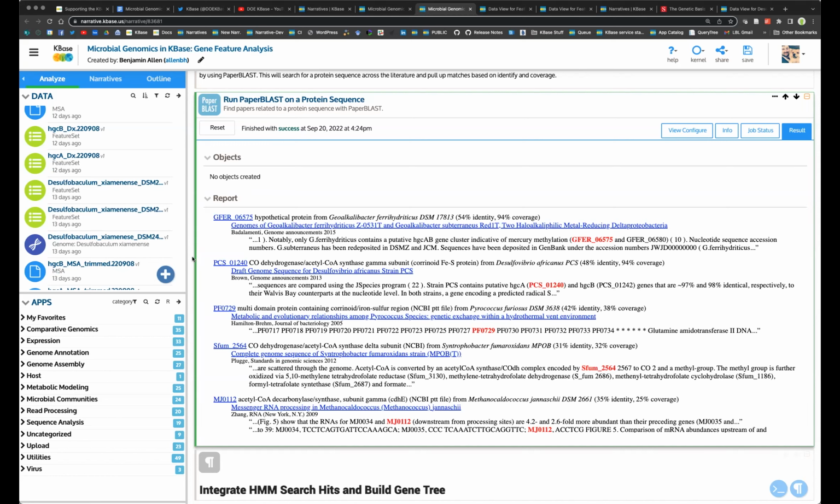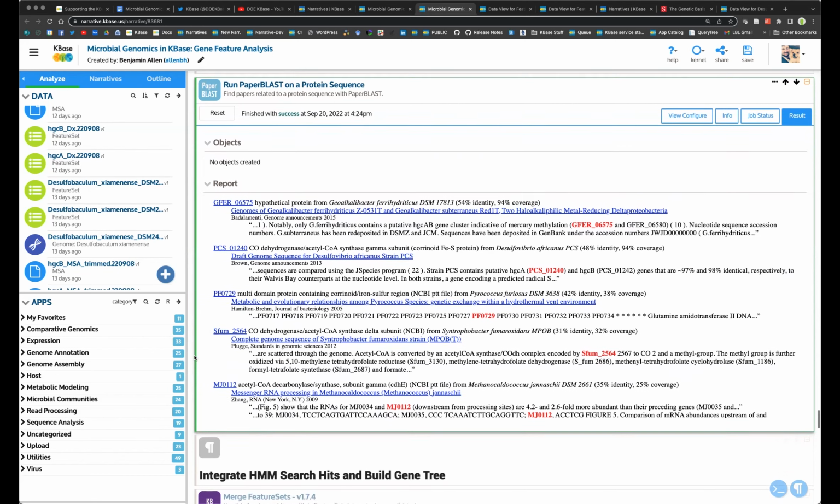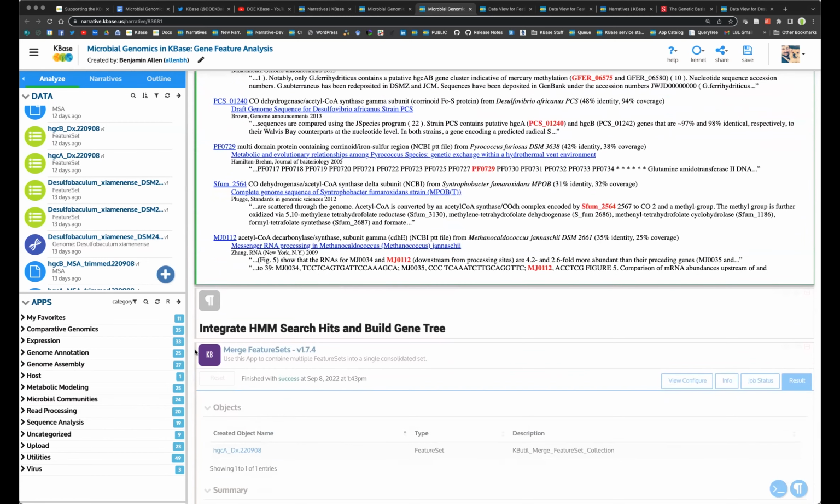Or as we add new genomes or sequence, you can rerun these searches and continually manifest that data into objects in the KBase system. We think that this will be very much like a future direction of the science here, where people might be curating whole custom sets of features and this kind of stuff to use for characterization and other things.